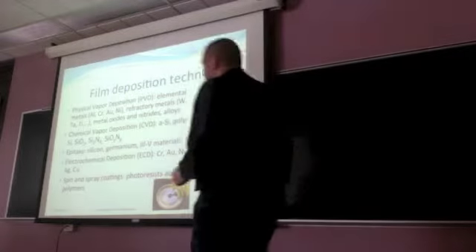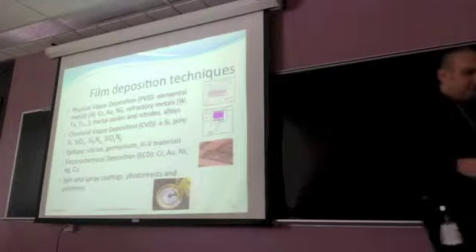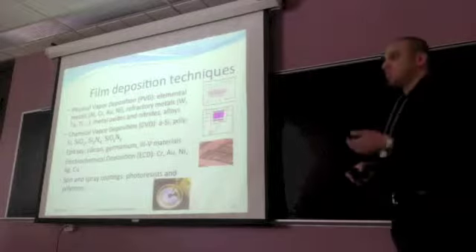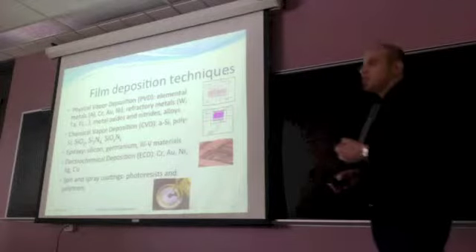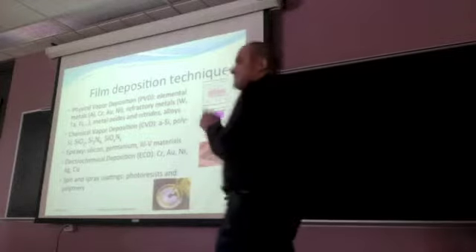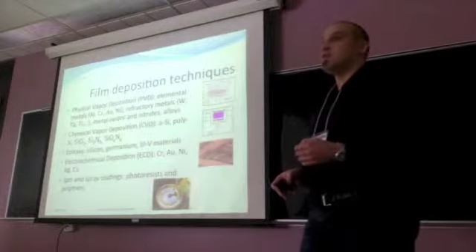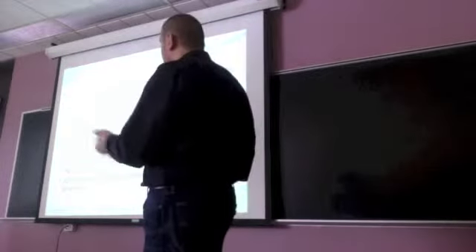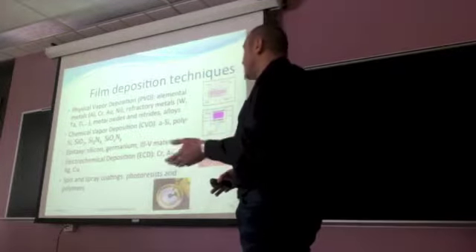Electrochemical deposition is a process by which a metallic film is deposited from a solution of ions onto an electrically conductive substrate. This technique is widely used for the fabrication of copper interconnections in microprocessors. And finally, spin and spray coating are widely used to deposit photoresist polymer. In the next slide, I will talk about spin coating.